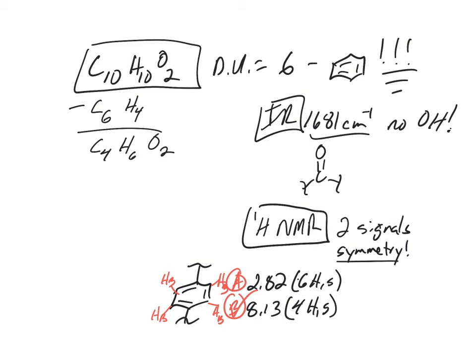If you're next to an oxygen, you're going to be at 3.5. You're going to be a little higher. So we should be thinking, CH3s. Maybe we don't know. Maybe it's too hard to guess. But we know we have two CH3s, and we label these as the A's. So let's subtract those pieces out. Maybe we're not sure yet. Maybe they are next to the oxygen. I don't know. Let's just see what falls out.